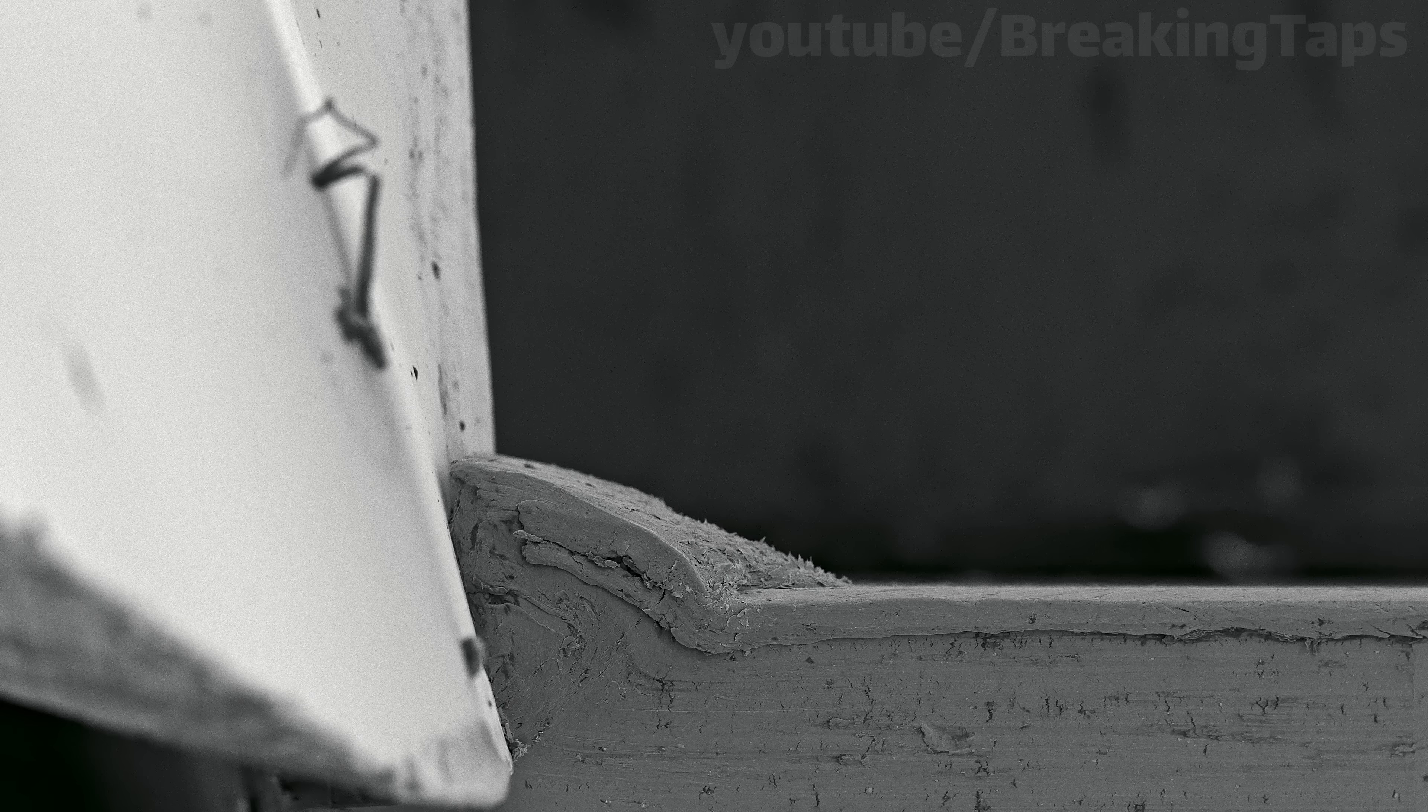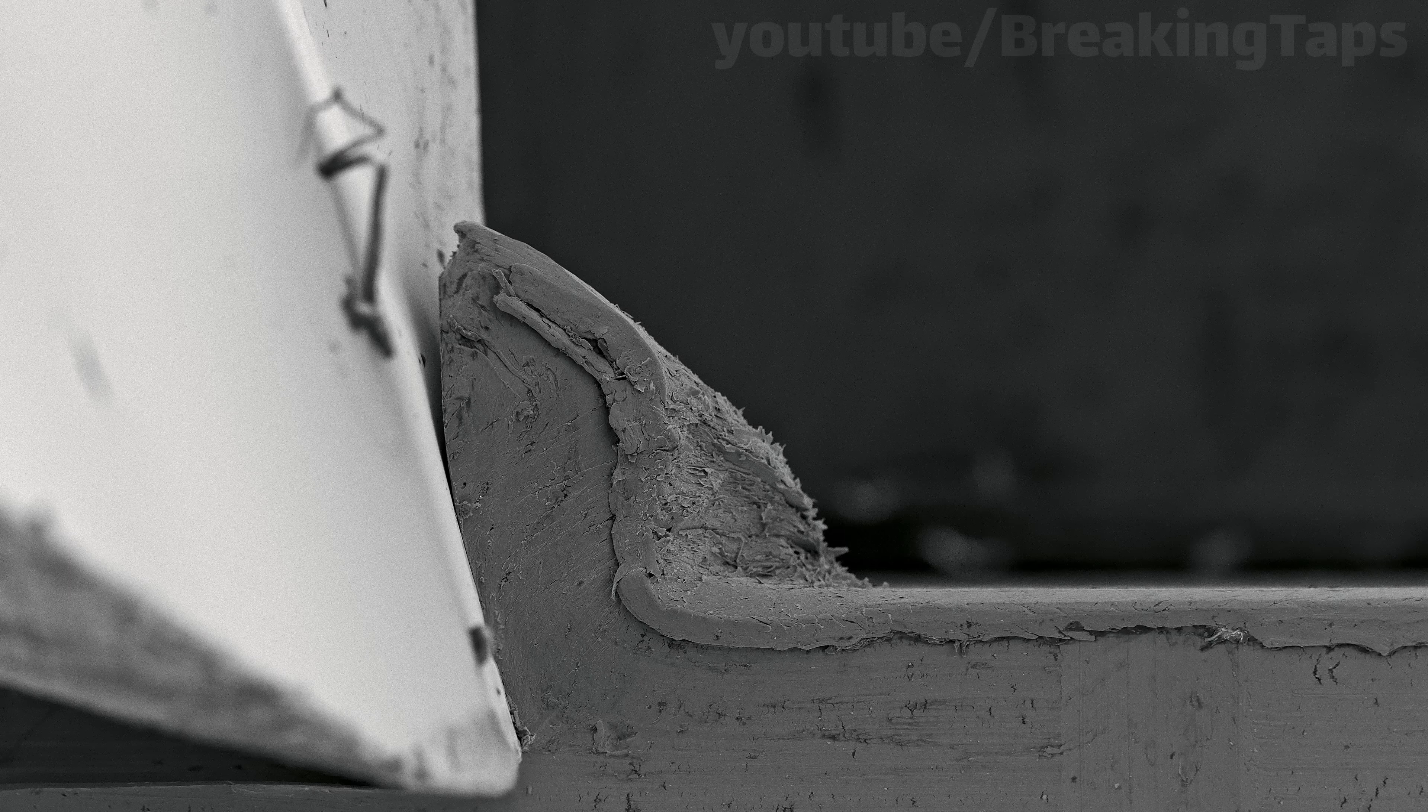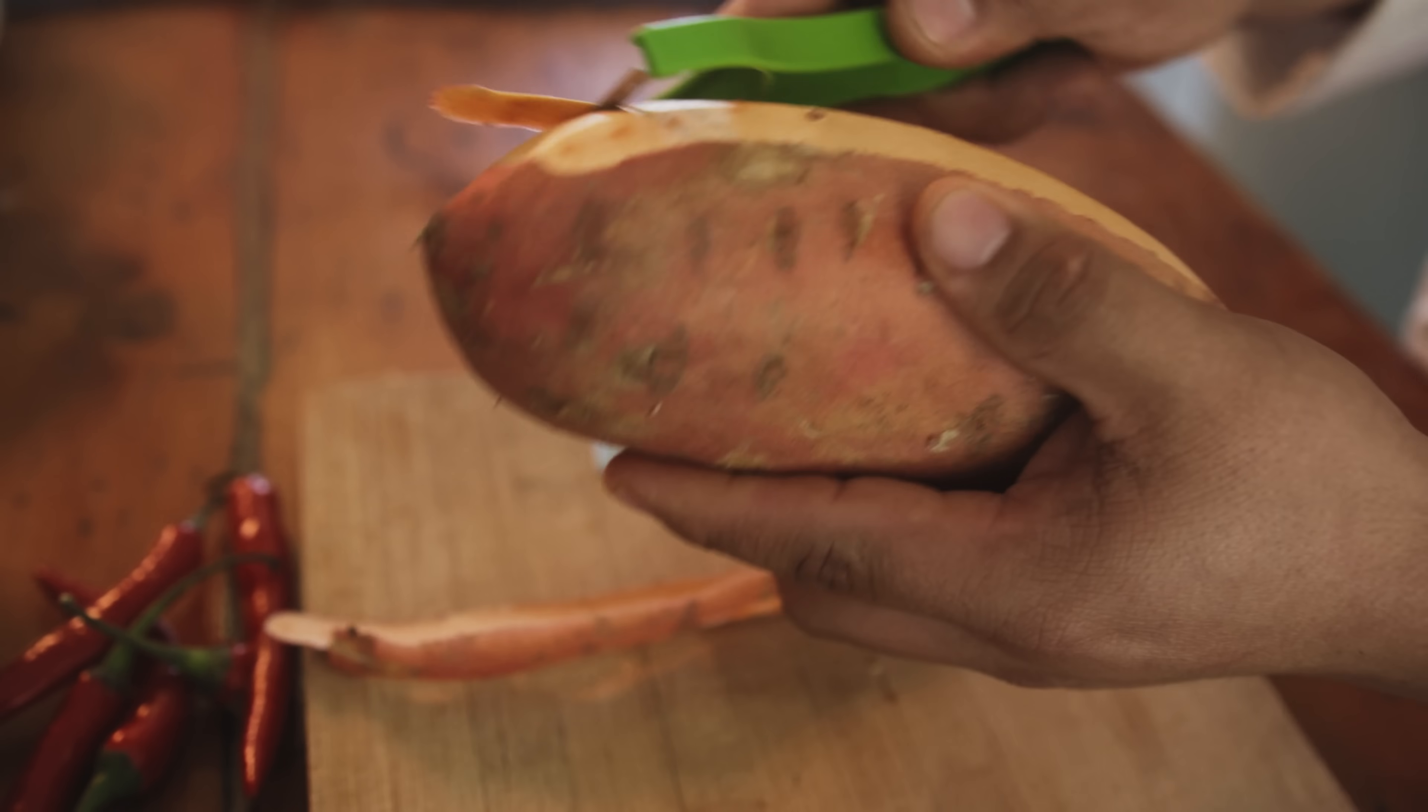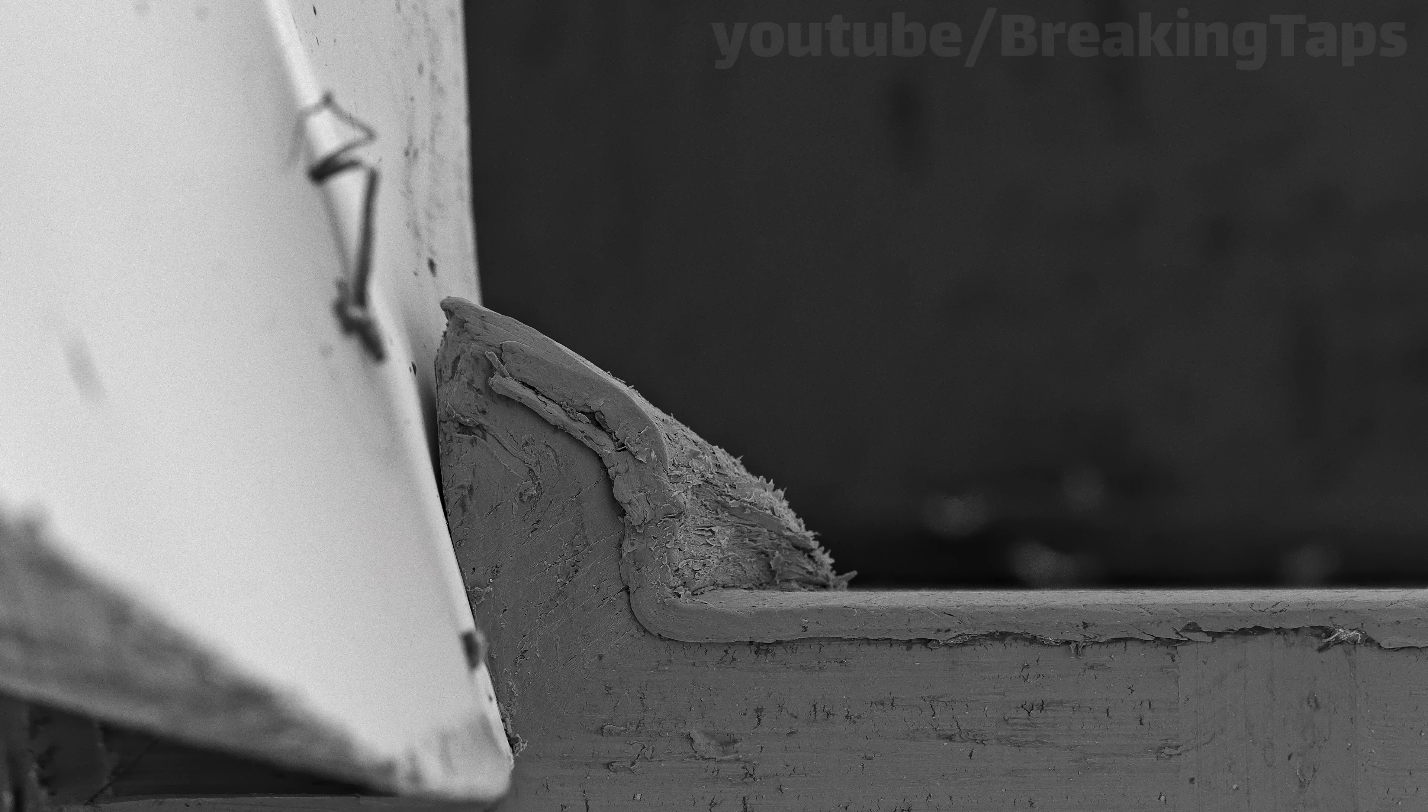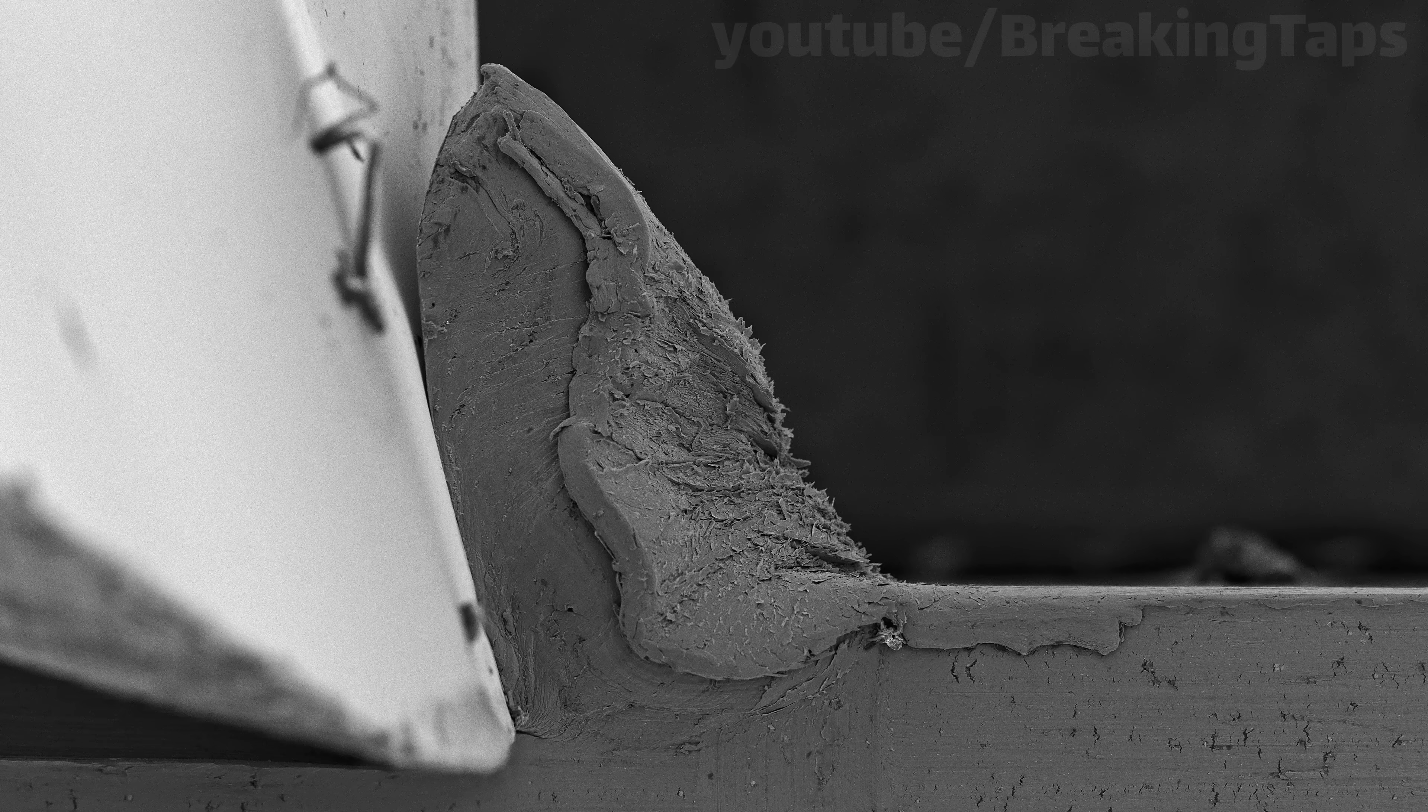So if you look closely and watch these stripes in the material, you can see how the aluminum gets stacked on top of itself. You'd think it'd be like peeling a vegetable and the skin kind of comes off in one long continuous strip, but it's actually a lot more like that clay demonstration. As the cutter advances, layers get sort of piled on top of each other.